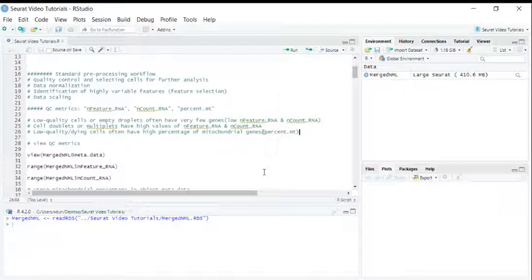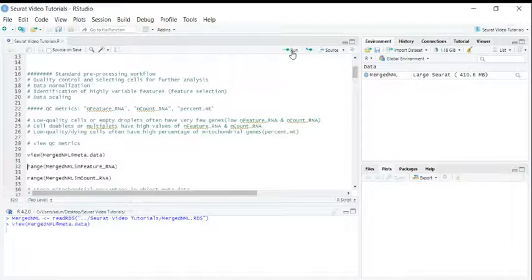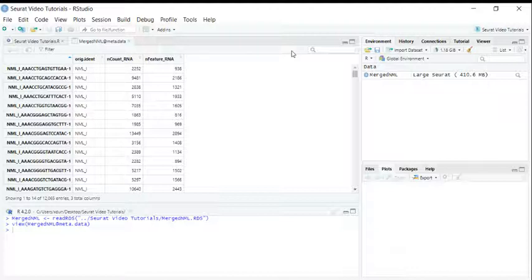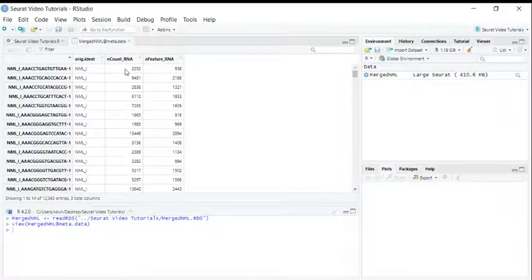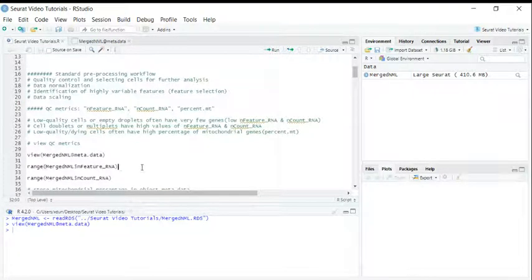The QC matrix data are stored in the metadata. We can use the View function to have a look at the metadata. You can see the n-feature RNA and the n-count RNA. The n-count and n-feature information was stored in the metadata when we created the object. Note that the value of n-count is normally bigger than n-feature. Let's use the range function to look at the lowest and highest values of n-feature and n-count.